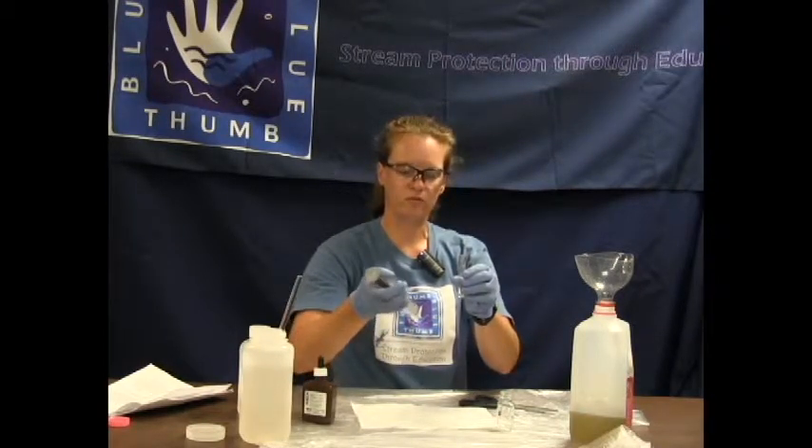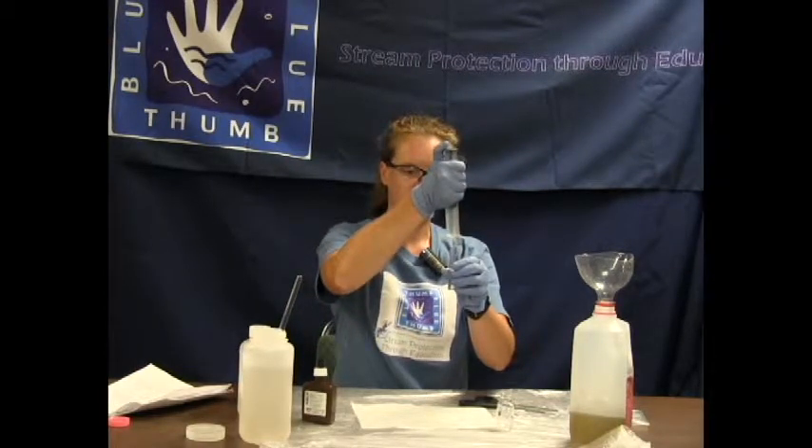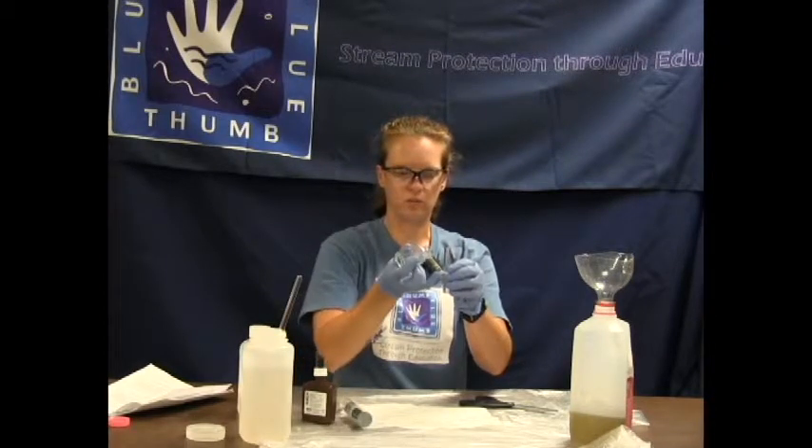We are going to fill from the syringe, creating a reverse meniscus — a big bubble on top of the plastic measuring tube. Then get all of that into the square mixing bottle.